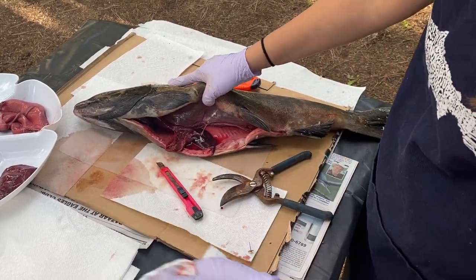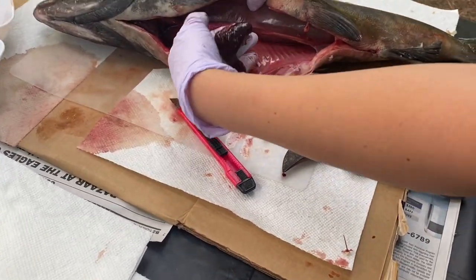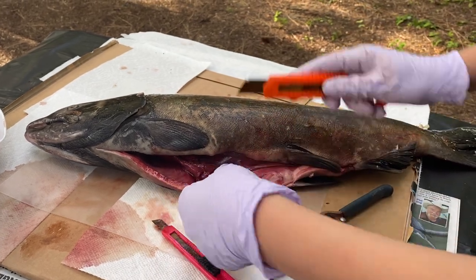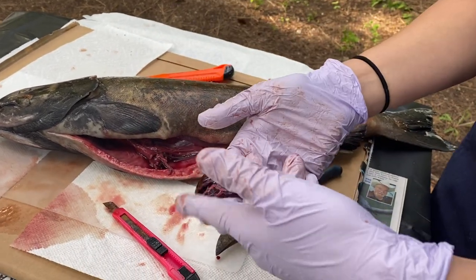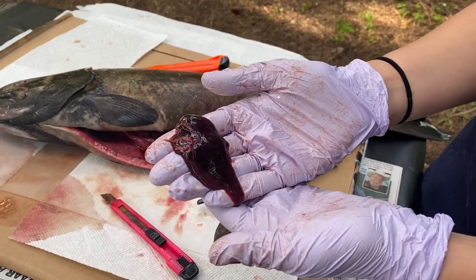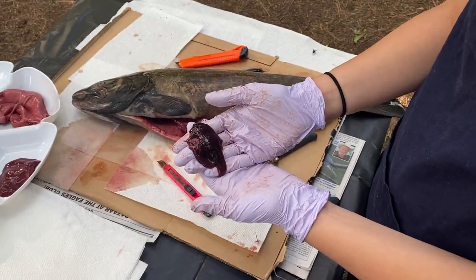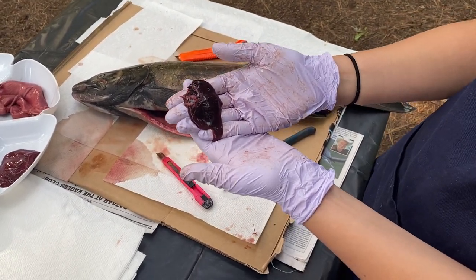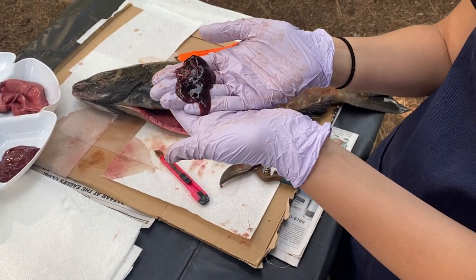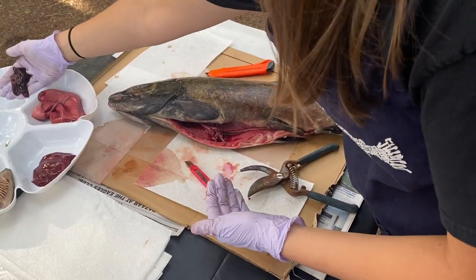The next organ that we see in here is going to be another really red organ, and this is going to be the salmon spleen. You can tell a lot about its function by the color of the organ. Usually the organs that are more blood colored are the ones that help filter the blood. White blood cells are produced in your spleen and red blood cells are recycled. It's also a little blood storage sac for emergency situations, so there's really healthy blood stored inside the salmon's spleen also.